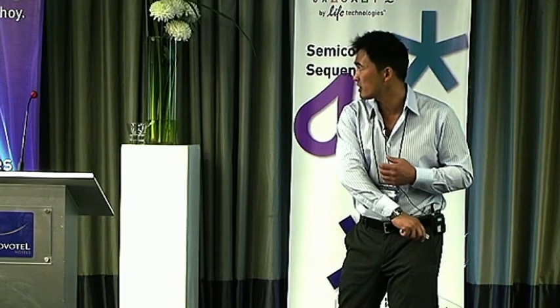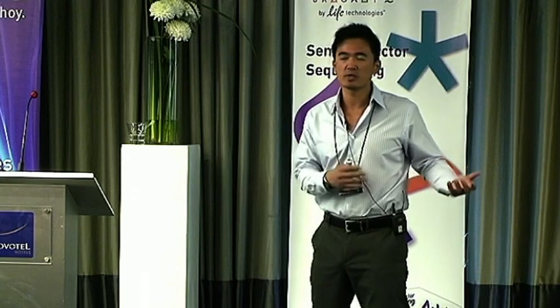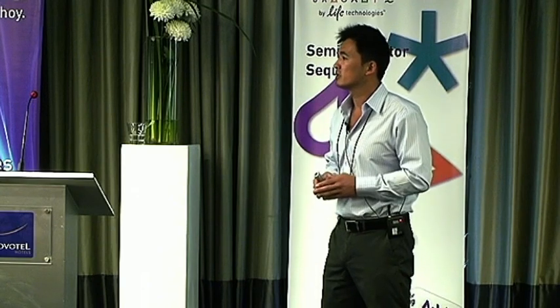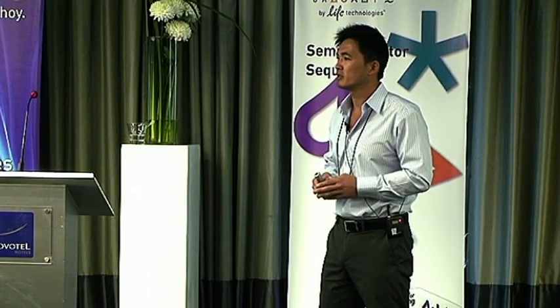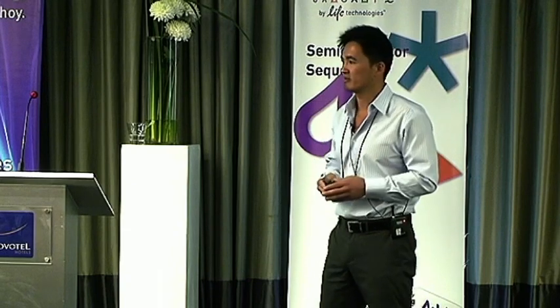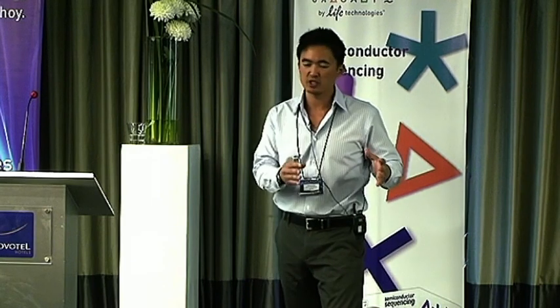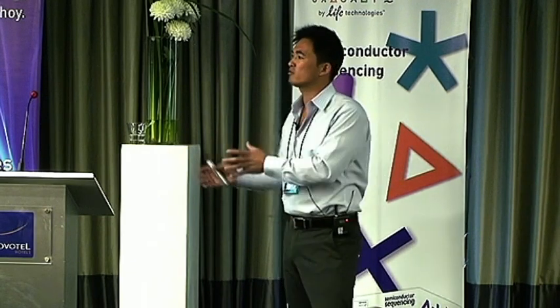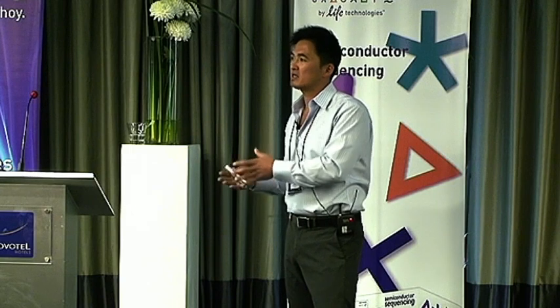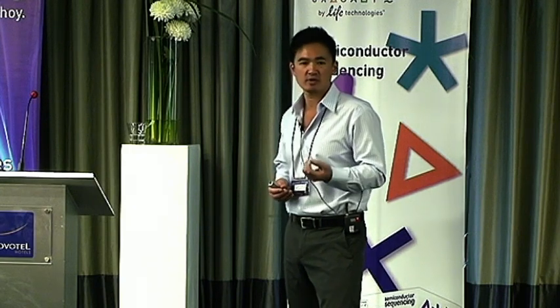I'll start concluding the talk here by talking about somatic mutation detection because I think this is a nice segue into our upcoming talks that Andy will be delivering on the Ion Torrent and the AmpliSeq cancer panels. Tony actually mentioned those this morning as well. But somatic mutation detection is something of extreme interest, obviously. So we, from a next generation sequencing standpoint, but also from a qPCR standpoint, recognize the need to come up with assays that can actually interrogate these rare variants.